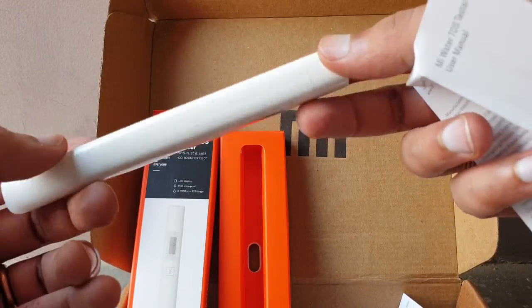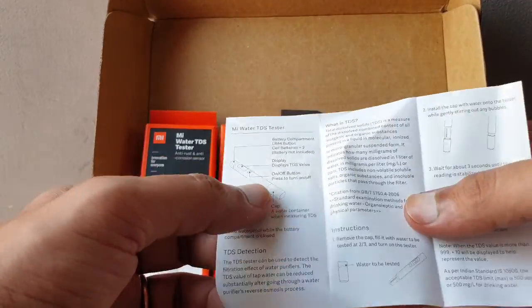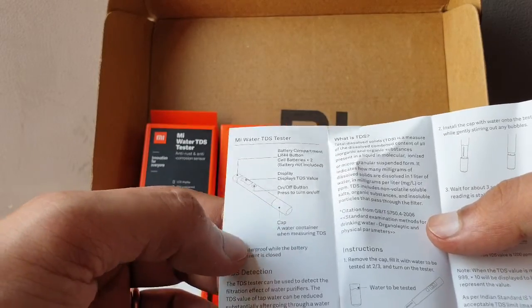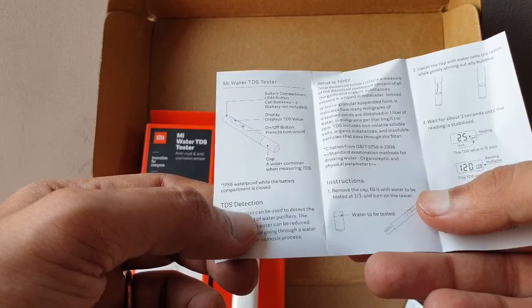This is the display window. Right now I don't have the batteries so I can't use it — I have to go buy them first. The device has a battery compartment, display, on/off button, a cap water container for measuring TDS, and is IPX waterproof rated.